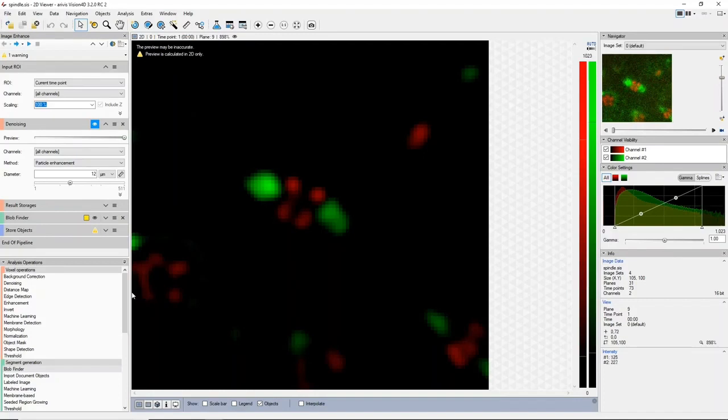We've added a few new operations in the pipeline as well. So you'll find we have a new distance map operation, for example. This is something that a lot of people have been asking us for for a long time. It is something that I've been fighting for on your behalf with our engineers to make sure that this gets implemented, as it's been wanted for a very long time. I'm delighted to have this in, and we'll probably cover this distance map operation in a future meeting, or maybe if we have some time today, I can show you some of the new results.